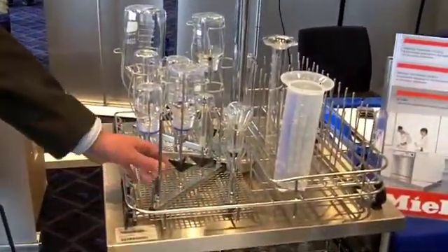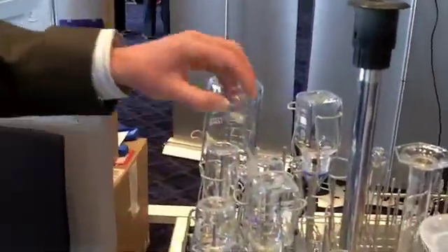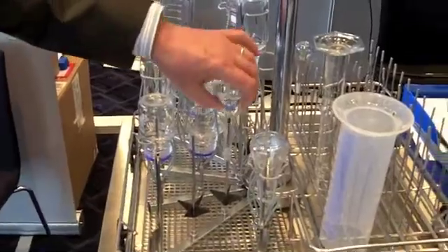Here I have an injector basket for conicals and narrow-neck volumetrics. The idea of the injectors is that it gets right into the bulb of the glassware and will clean it out properly.